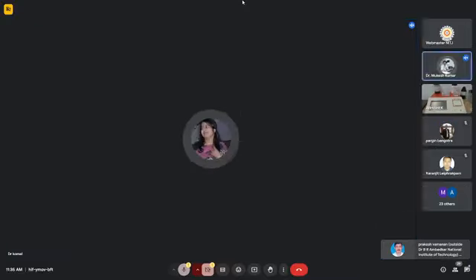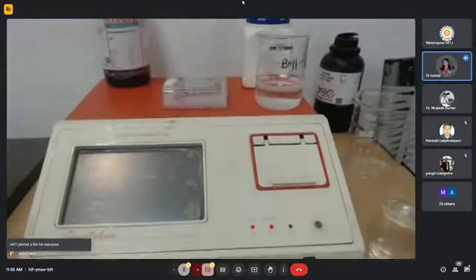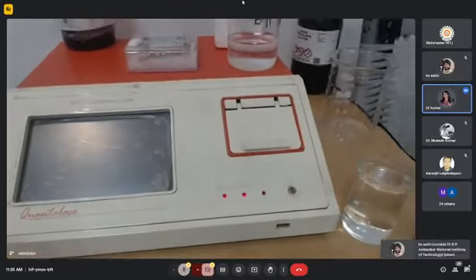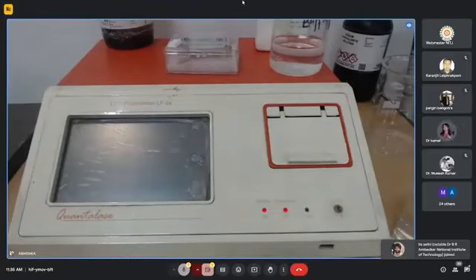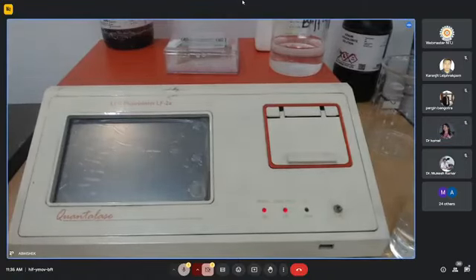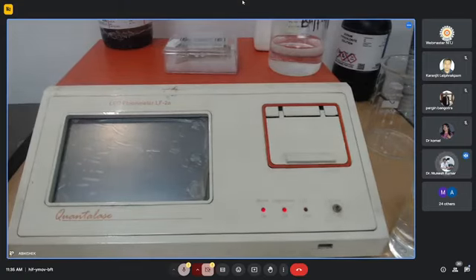You can also go full screen. While performing the measurements, I will give the zoom, and you have to show the readings. I understand that also. Definitely. So shall I start again, ma'am? Yes, please. Please continue.